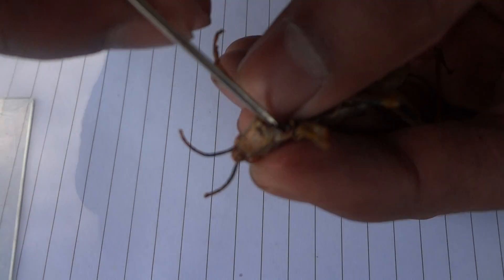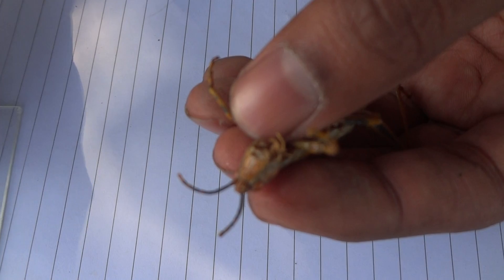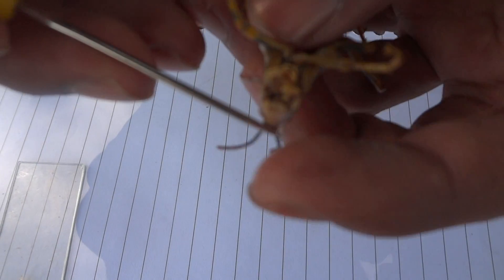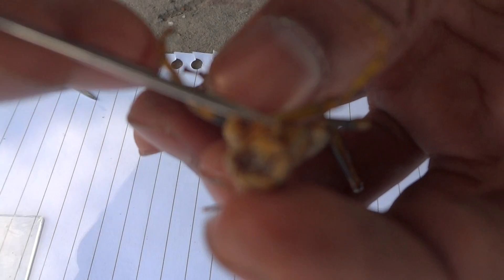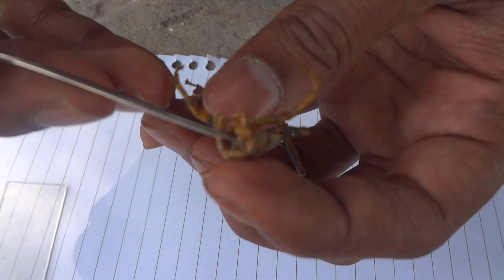This is the second pair. And this is the hypopharynx of the grasshopper — it is very well clear in this specimen.